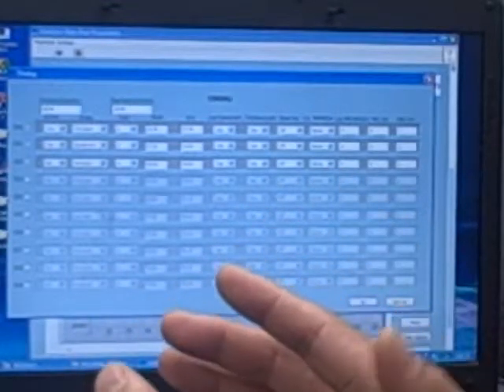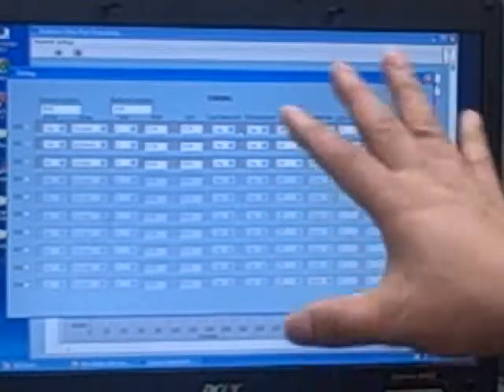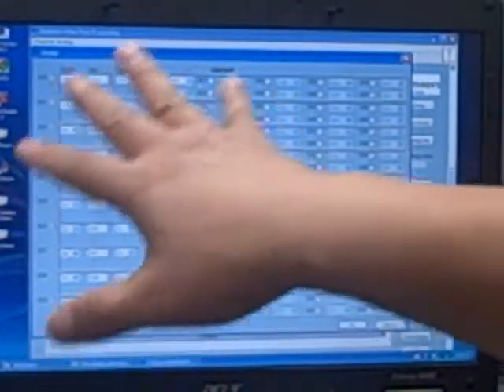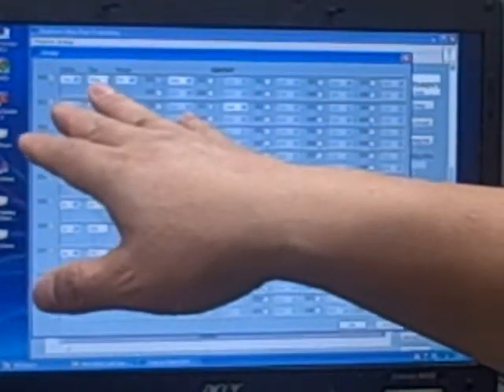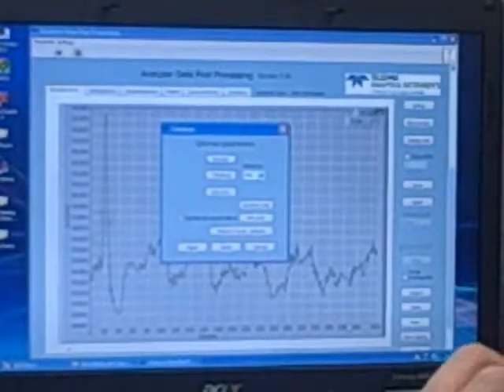Timing. That's the place where we define the time of each peak of compound of interest. That's the most important one. So this is defined forward, backward time, the gain, the beginning and end of time of the peaks and other things. You click OK again. You click group, and then here is the place you can find the naming of the compound, the range, and which peak is tagged into the compound. You have to click OK as well.